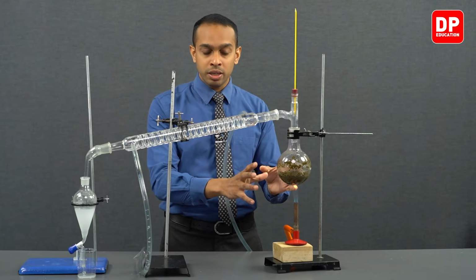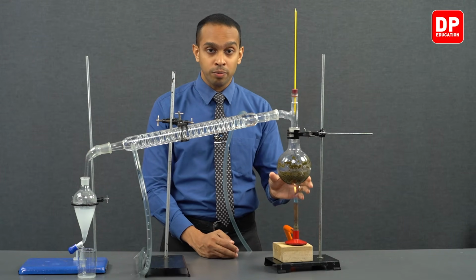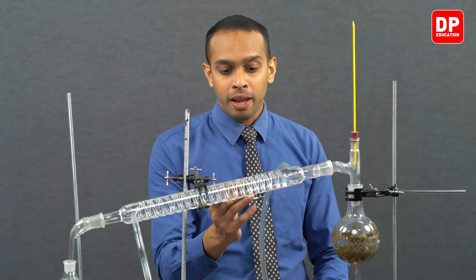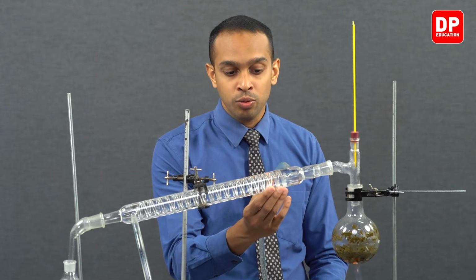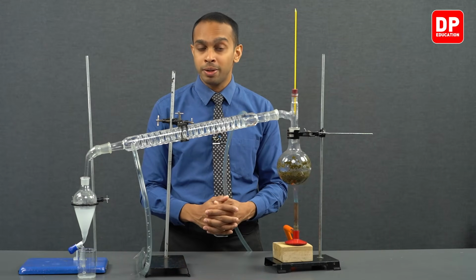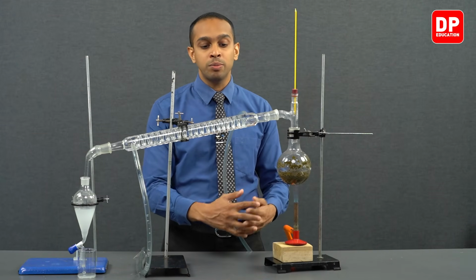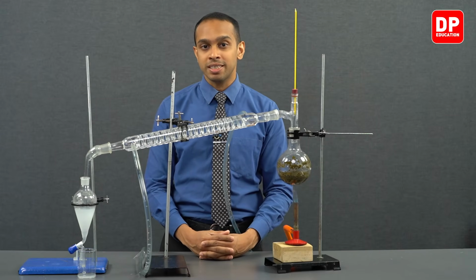You will gradually turn it off and take the heat source away. If you do it quickly, the pressure inside the system will drop, and some of this water and essential oil mixture will run back into the round bottom flask. To avoid that, we will gradually decrease the temperature, gradually cool down the system, and remove the heat source from this round bottom flask.